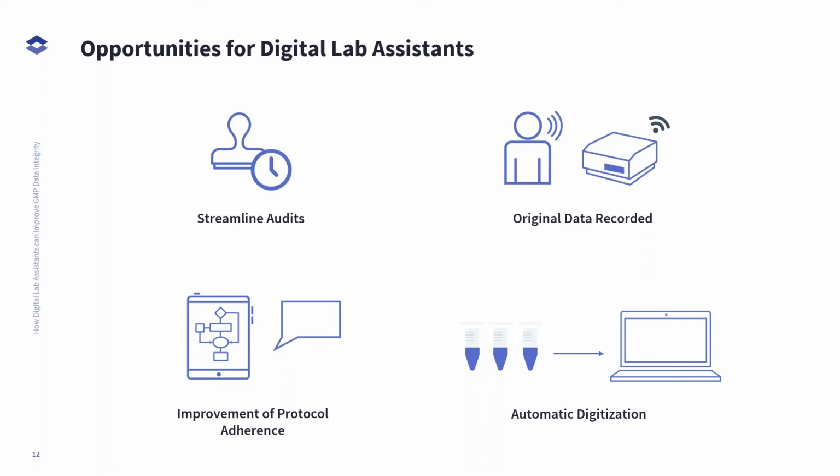Right, yeah. So in that case, just so I have a good understanding, that person would need to really remember what they were doing in that biosafety cabinet and document how that occurred accurately. Okay, interesting. Thank you for that, Eric.